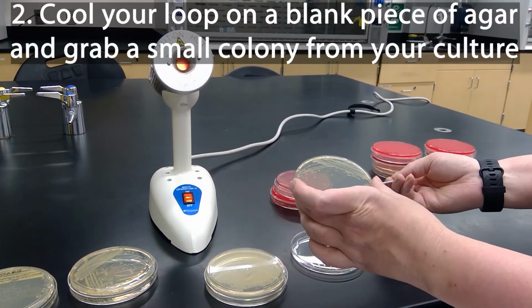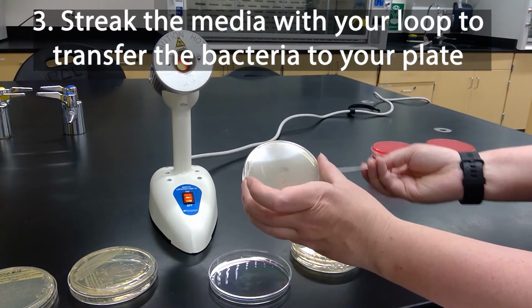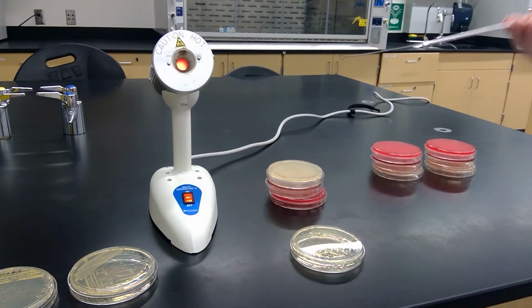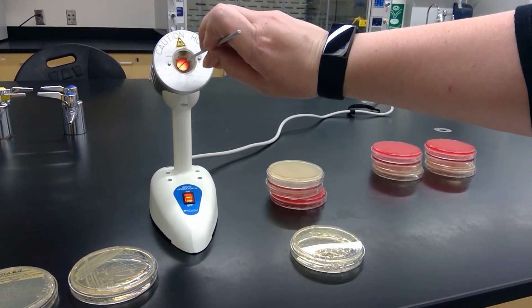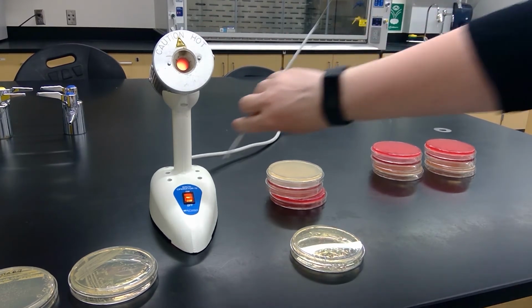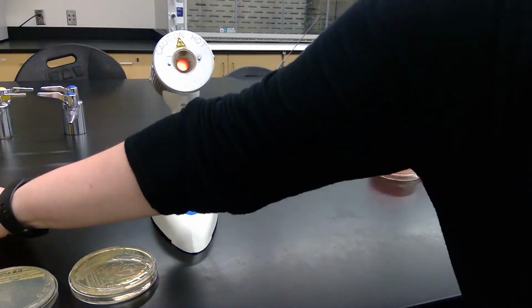Grab culture, and then streak it onto our plate. Then we'll sterilize our loop again. And then let that cool. We'll put these off to the side.